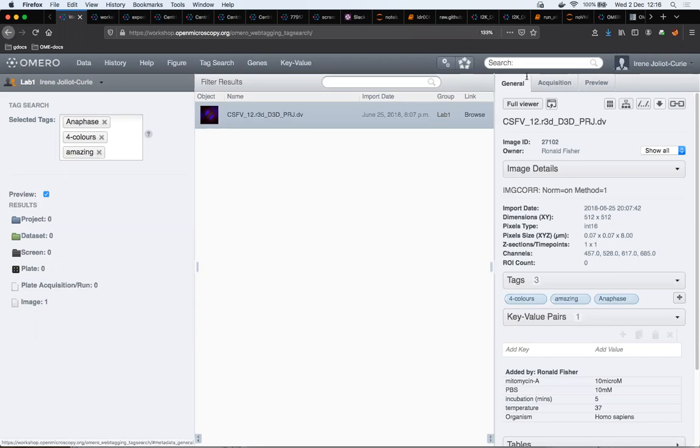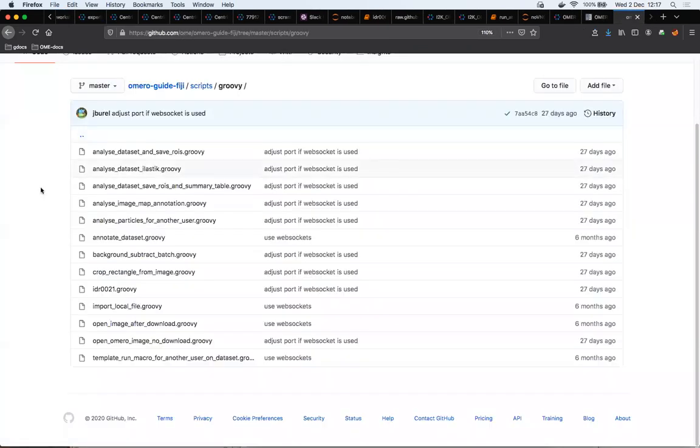What we want to do here is simply skip QPath. QPath is a nice tool, but I think some of you might be more interested in other things. Is somebody explicitly interested in QPath? Do you do whole slide imaging and stuff like that, ladies and gentlemen? Maybe not. Just move to Parade in that case. Okay, let's move to Parade. We are going to talk through OMERO.parade. Not really. Excellent. Thank you, Christina.